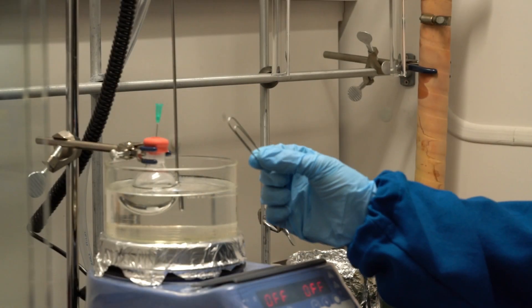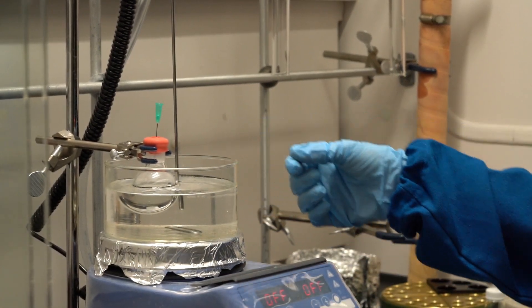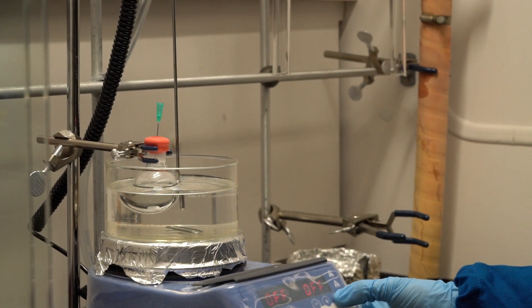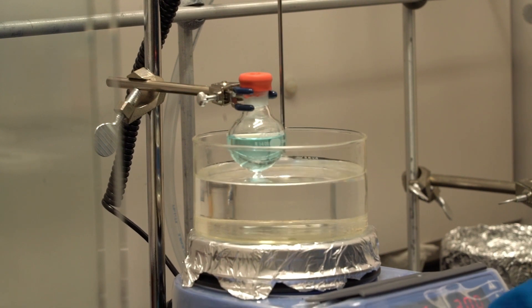A lab hack to ensure even heating is stirring the oil bath with a paperclip. As it rotates, the oil will circulate, but the paperclip is small enough to not hit your flask.